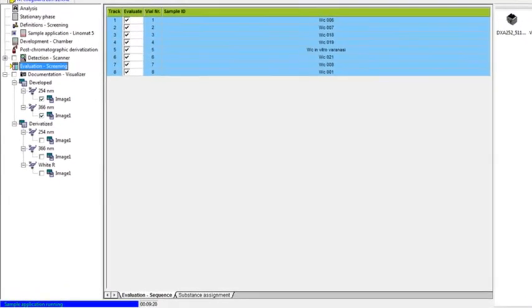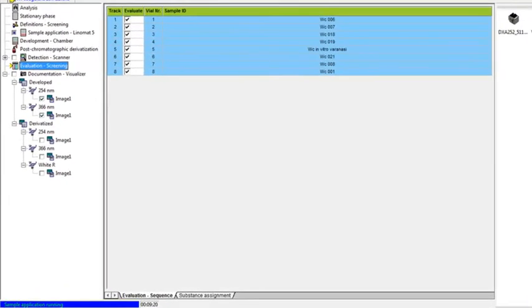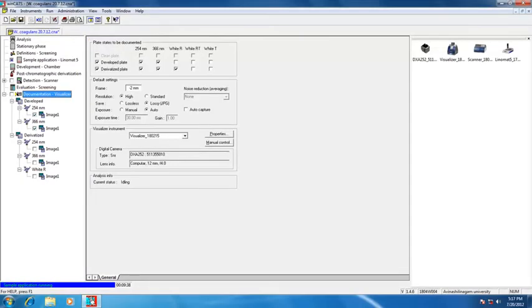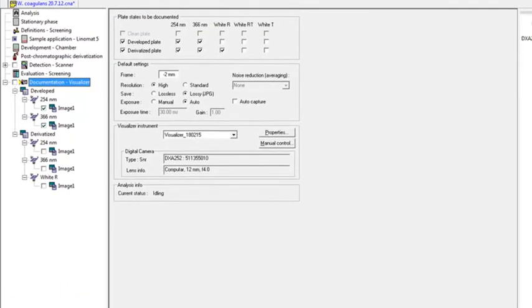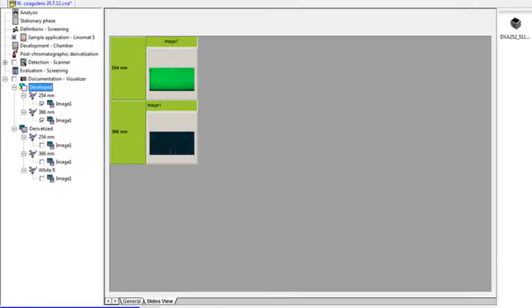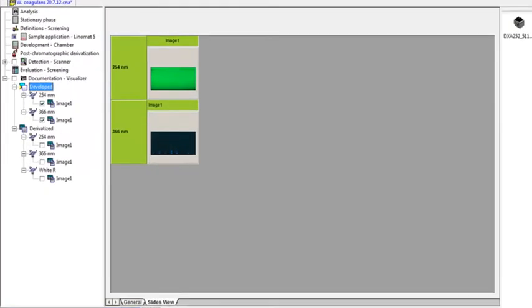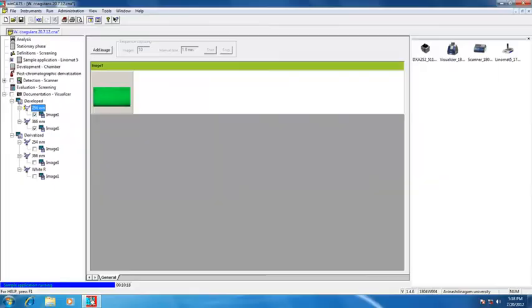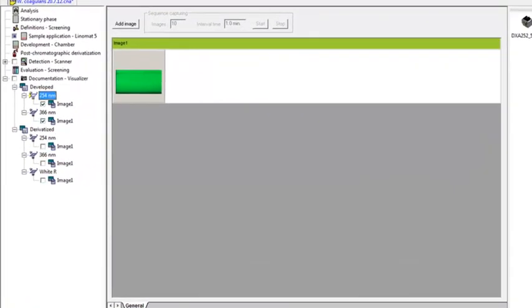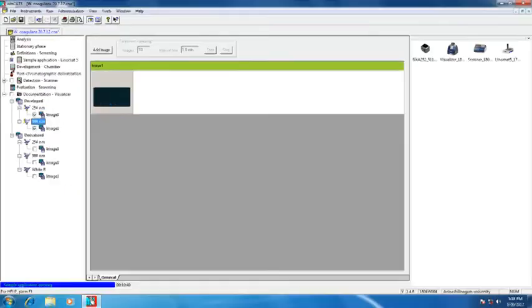In evaluation, it is evaluated by the software. In documentation, using the visualizer in both nanometers, it is taken at 254 nm, 366 nm, and also at white light. Here are the images obtained at 254 nm and 366 nm.